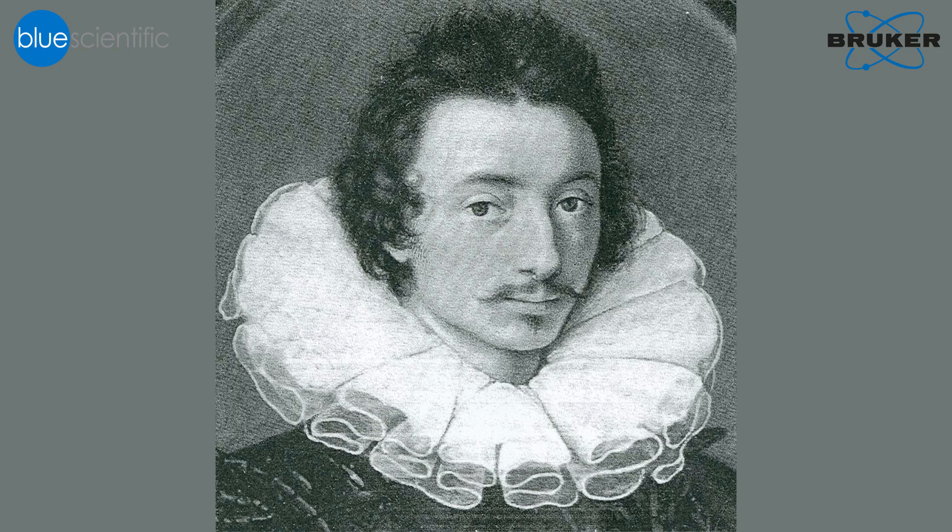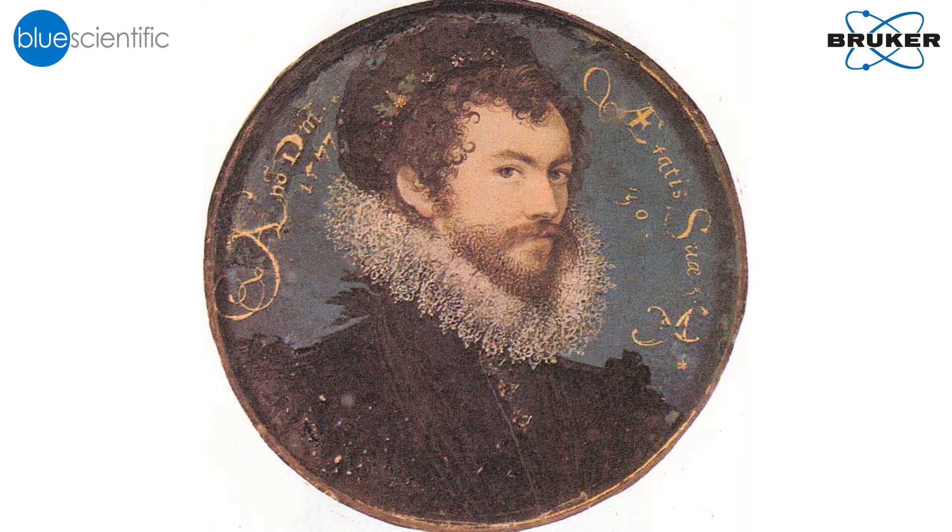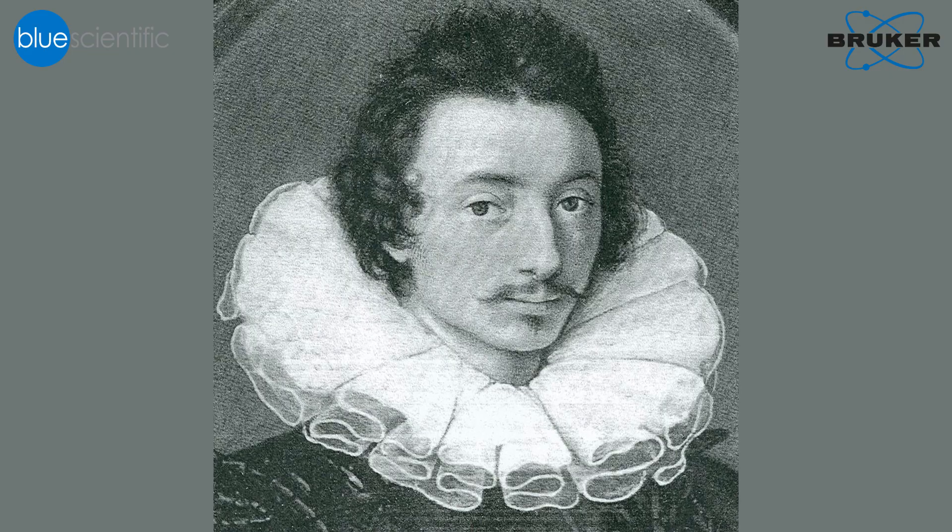We've been investigating miniatures painted by Isaac Oliver, who is one of the best limners of the late 16th century. He's a really interesting character and not very much is known about him. He supposedly was a pupil of Nicholas Hilliard, who is very well known and wrote a treatise about the art of limning, but Oliver frustratingly never wrote anything about his training or about his work. So while a lot has been done on Hilliard, because you can compare what he wrote with what he did in his miniatures, there's very little that has ever been done with Isaac Oliver.